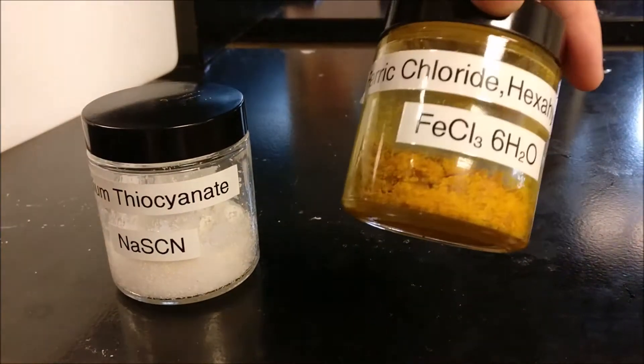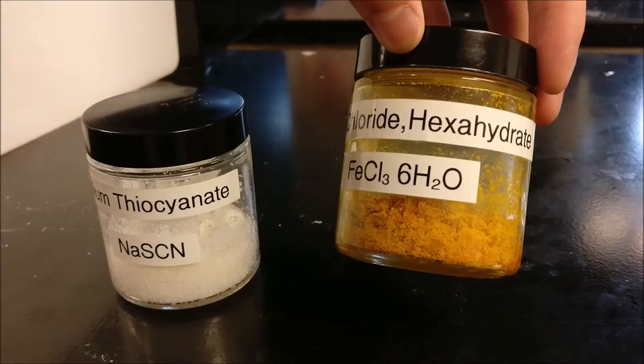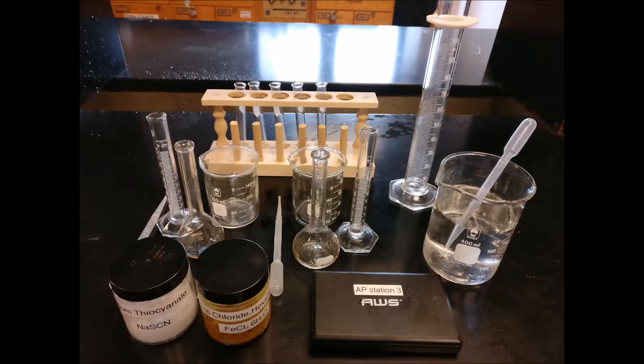We need sodium thiocyanate and iron-3-chloride hexahydrate, an electronic scale, two 50 ml volumetric flasks, two 10 ml graduated cylinders, and one 100 ml graduated cylinder.